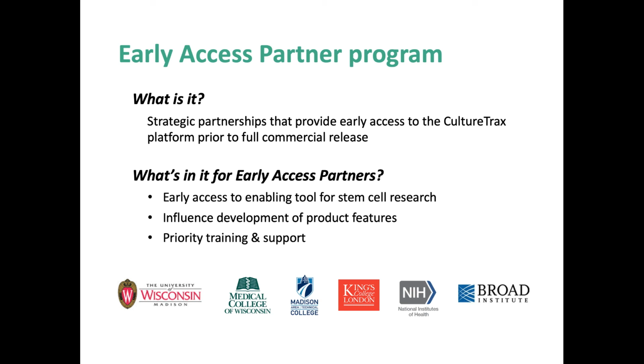CultureTrax is currently in beta testing, and the way you work with us at this point in time is through our Early Access Partner Program. In this program, we're forming strategic partnerships with key thought leader laboratories, providing them with early access to the CultureTrax platform prior to when we release it commercially.